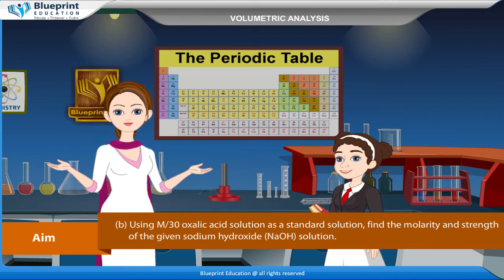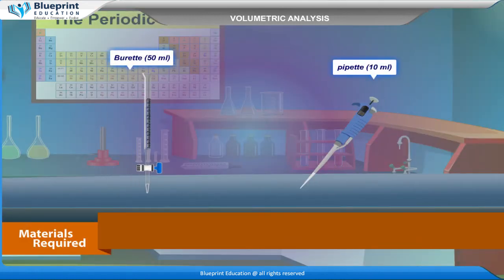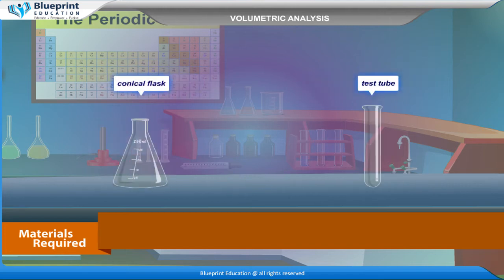The materials required are: Burette 50 ml, pipette 10 ml, small beaker 100 ml, volumetric flask, conical flask, and test tube.